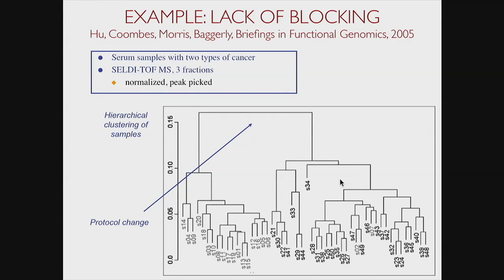So again, if there are things that we know will affect peak intensities and we know that they will occur, there is a way to work with that. But oftentimes, experiments are complicated. So you have many fractions, but maybe you don't just have healthy and disease. Maybe you have a time course experiment. Maybe you have some kind of time points for disease subjects. Maybe you have multiple treatments, not just healthy and disease, but also some kind of additional things. So very quickly, these things can become complicated enough that it's not so simple.